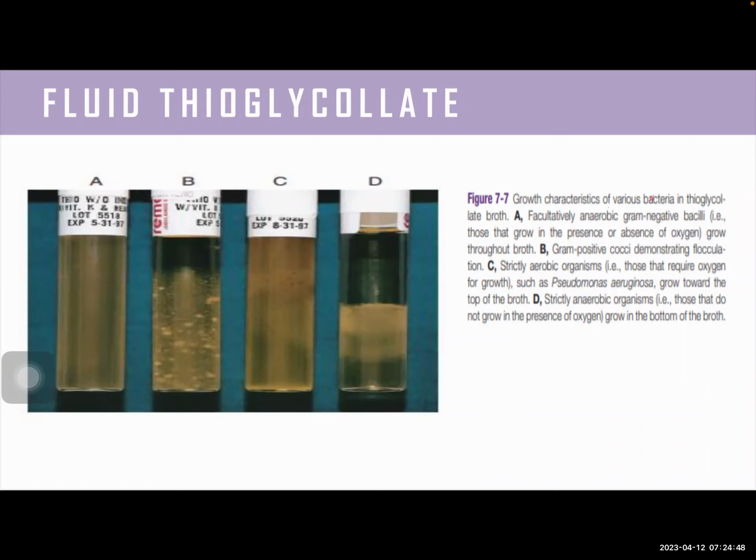Kuha ka lang ng test tube holder. Tapos ipitin mo yung culture bottle, tapos i-heat mo until may mag-bubbles na mag-form. Suddenly magbo-boil siya or magsisimmer siya. Pag may nag-boil na, then you can keep it out of the flame, wait for it to cool down, and you can use it. But boil it first before mo siyang gamitin.